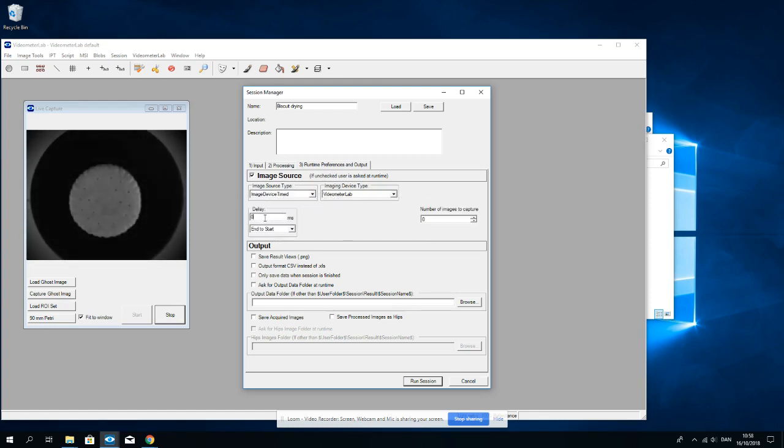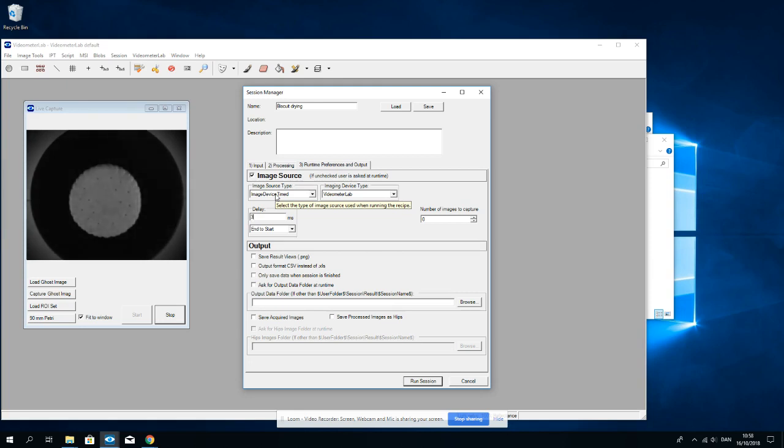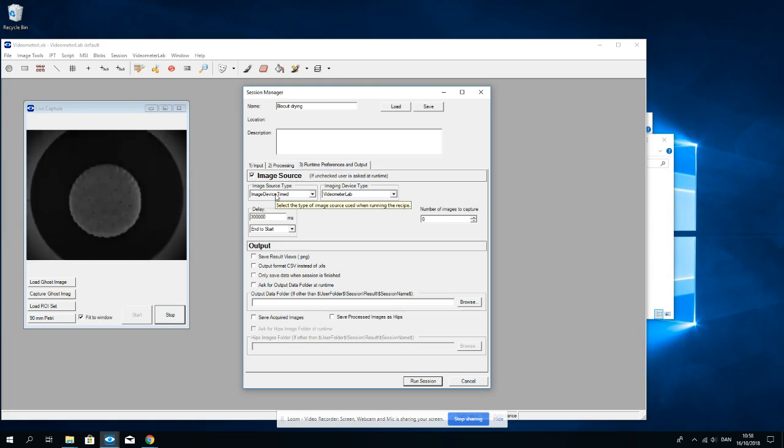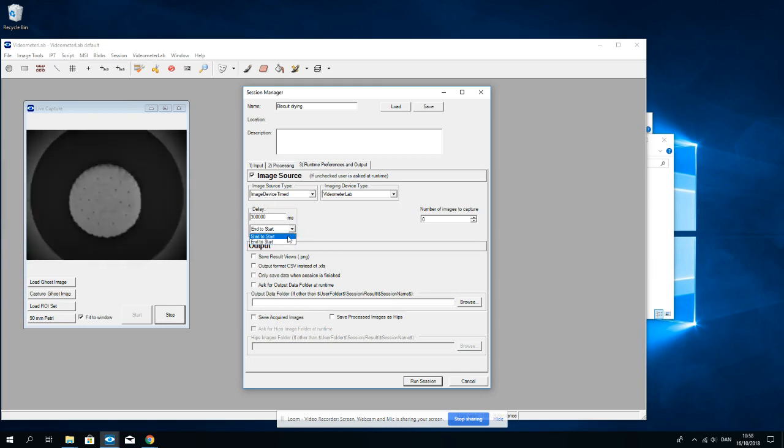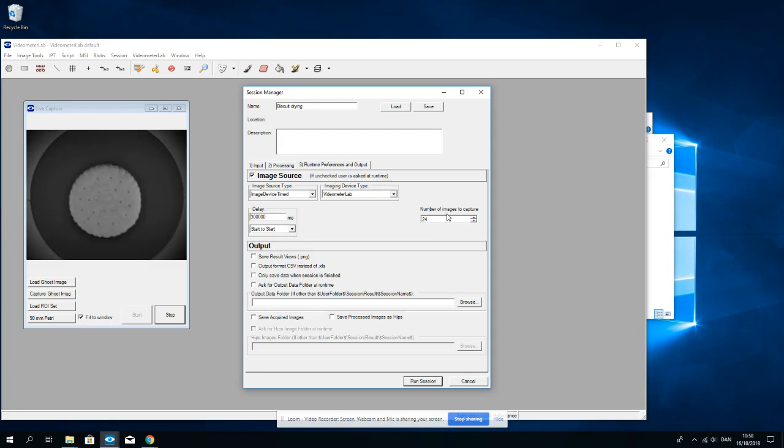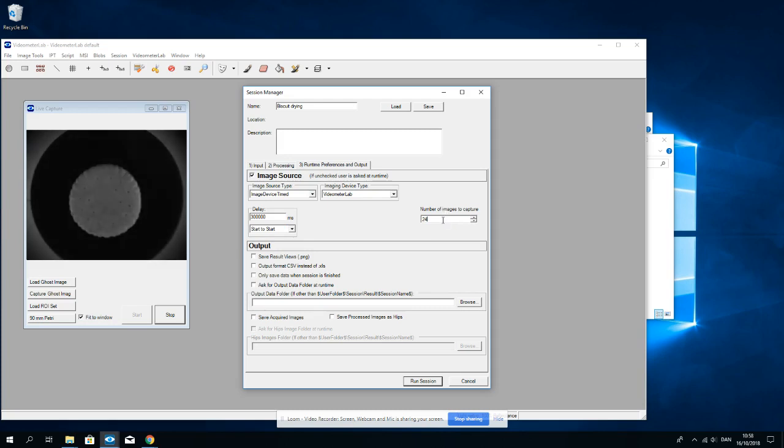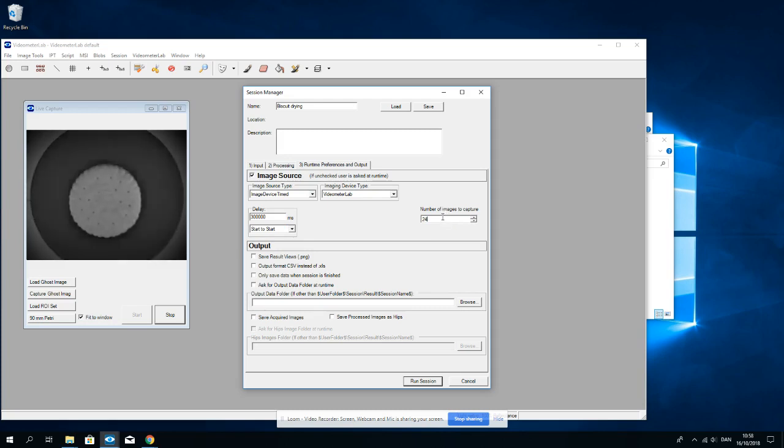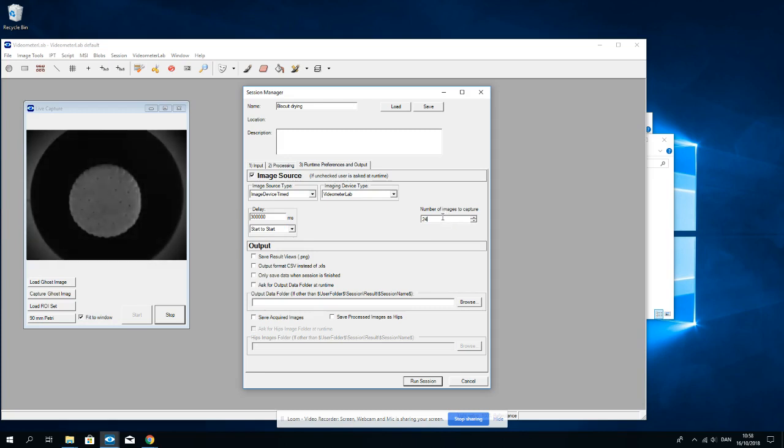I choose a delay of 300,000 milliseconds corresponding to five minutes start to start. And I capture 24 images to continue this capturing for two hours.